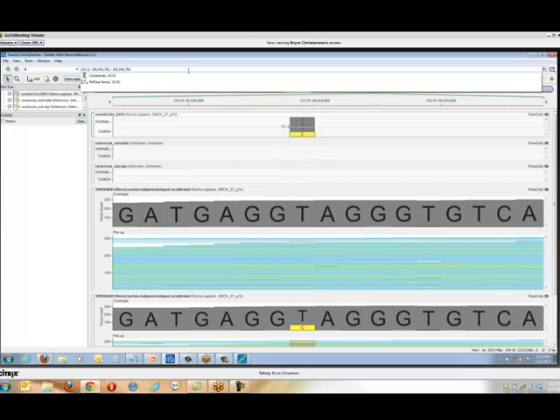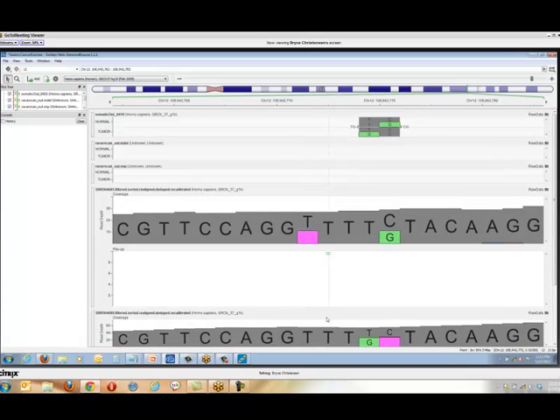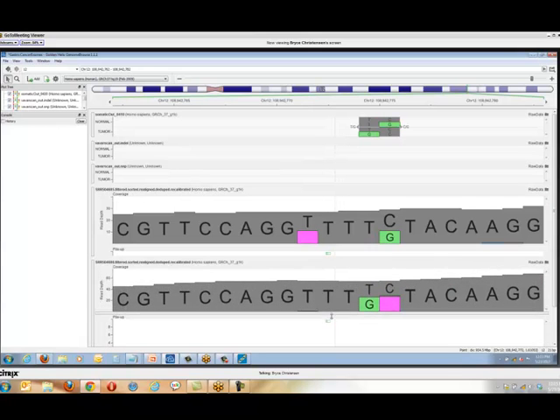This one can take quite a while to load up. But what I want you to see, we can actually see it just with the histogram view. We don't really need to see the alignment. This was a location that appeared to be a couple of somatic mutations between a normal sample here at the top and a tumor sample at the bottom.